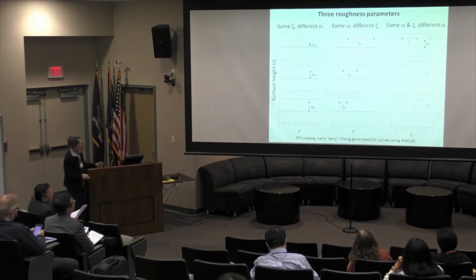So I want to emphasize more. This is just done by an undergraduate student using MATLAB. I hope this gives you the impression you need more than one parameter to describe a rough surface.